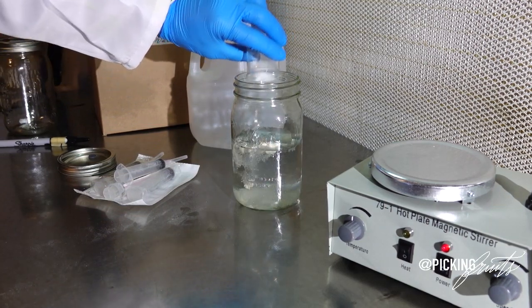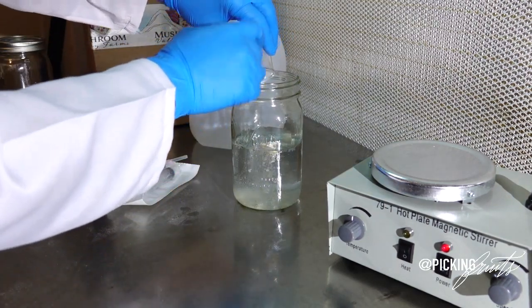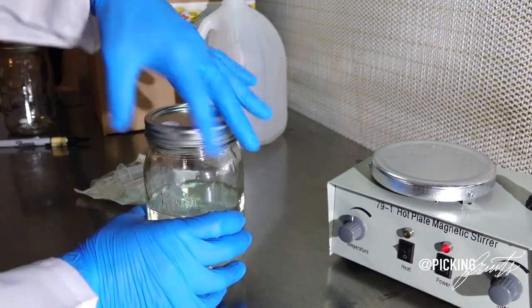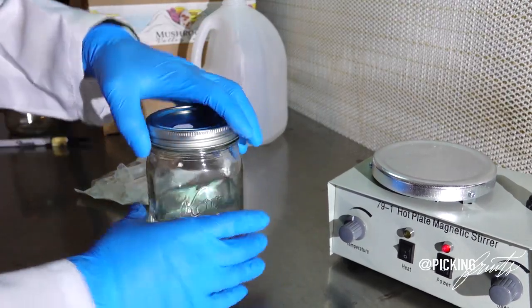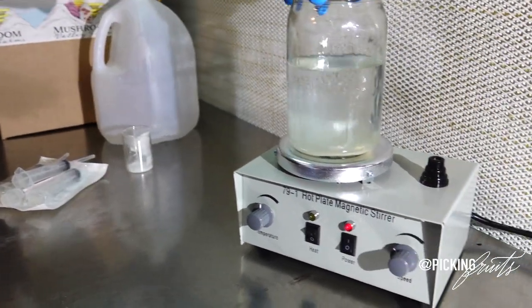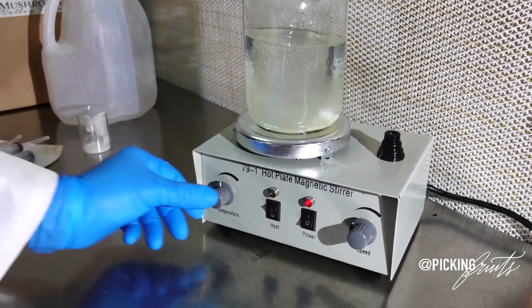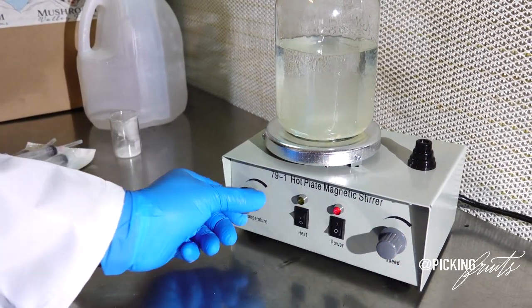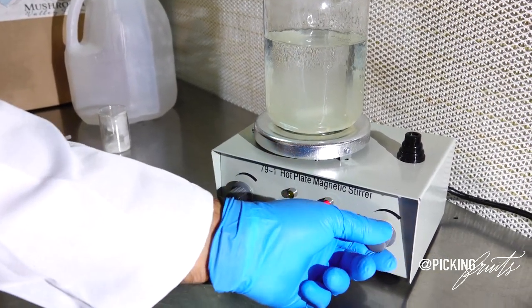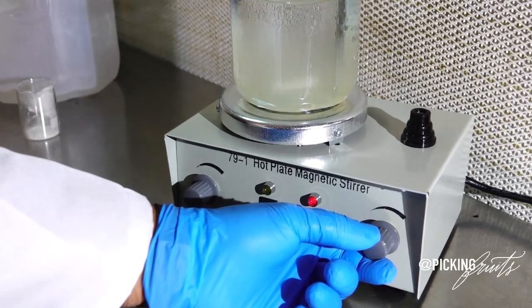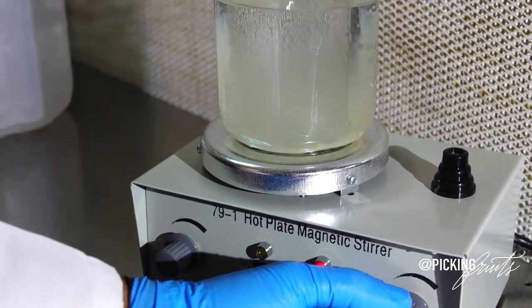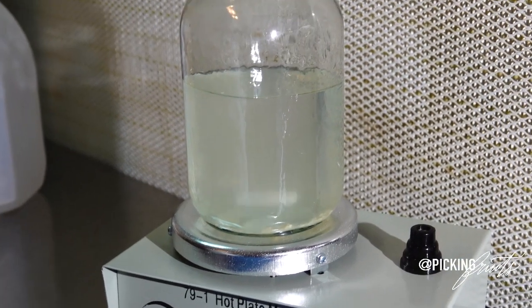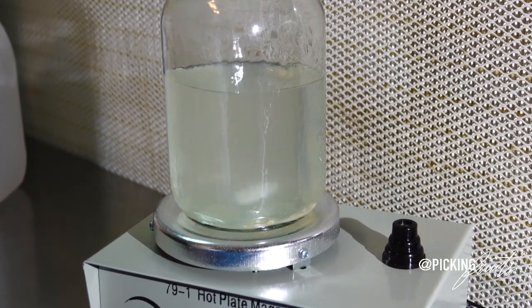So now I'm going to be adding my nutrients. And I'm going to seal these up. And I'm going to be placing them on the stir plate. So we don't need any kind of heat right now. And we're slowly going to increase our RPMs until our stir bar has thoroughly mixed all of the nutrients inside of the liquid.